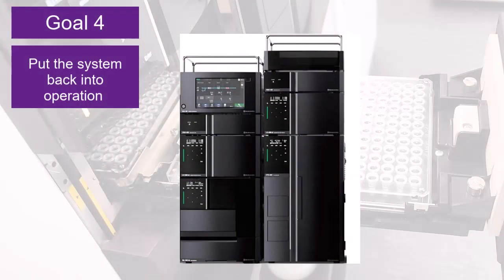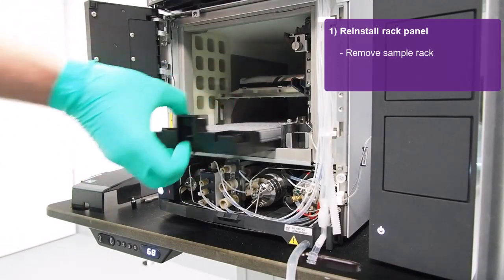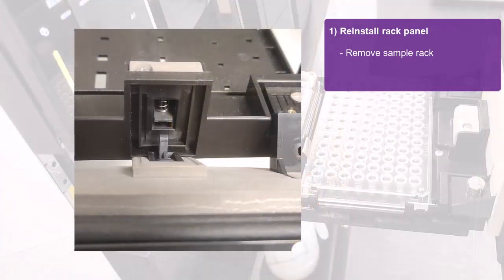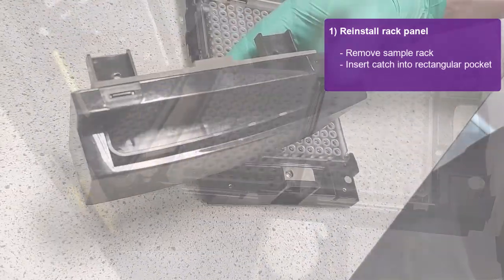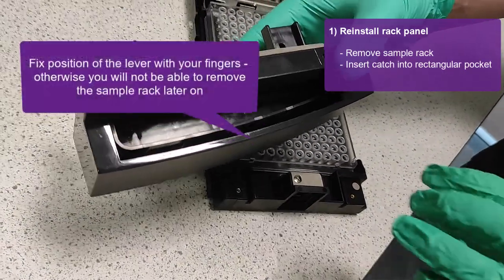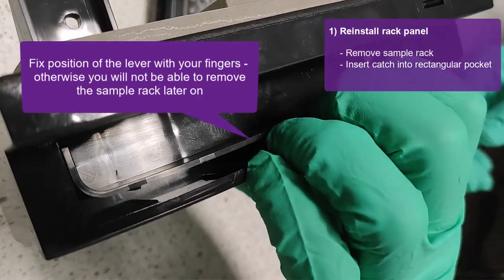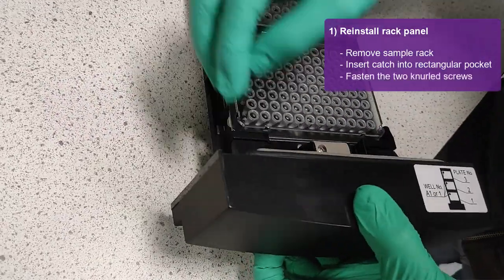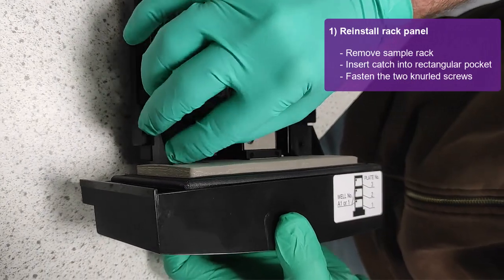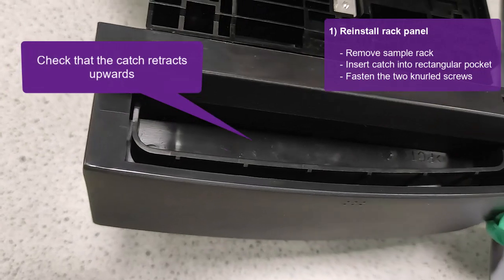The next goal is to put the system back into operation. First, remove the sample rack from the auto-sampler to reinstall the rack panel. Be careful to align the two parts correctly. The catch on the rack panel is inserted into the rectangular pocket of the sample rack. It is recommended to fix the position of the lever on the rack panel side with your fingers as shown, otherwise it may be blocked later on and you will not be able to remove the sample rack. Fasten the rack panel with the two knurled screws.